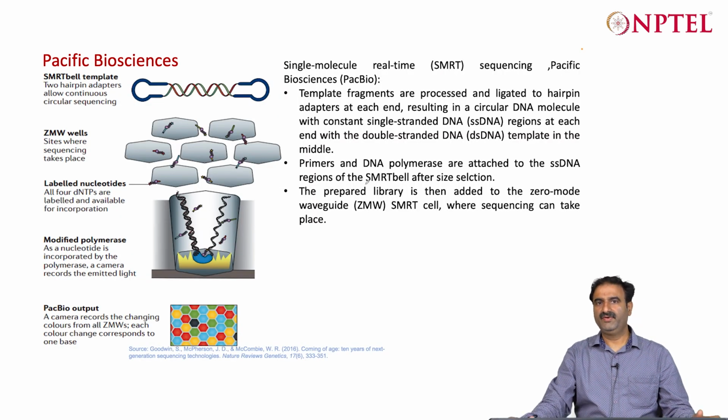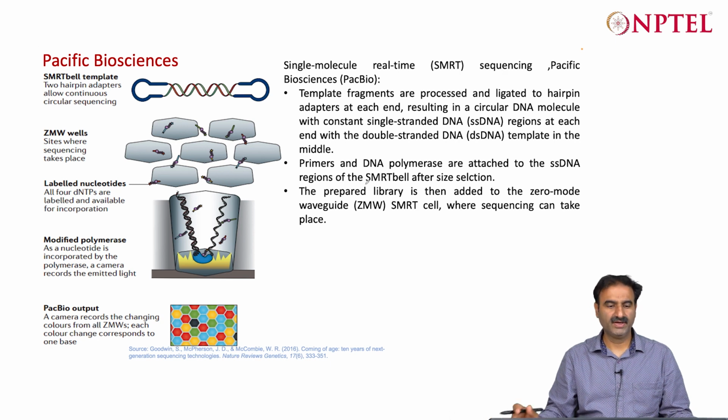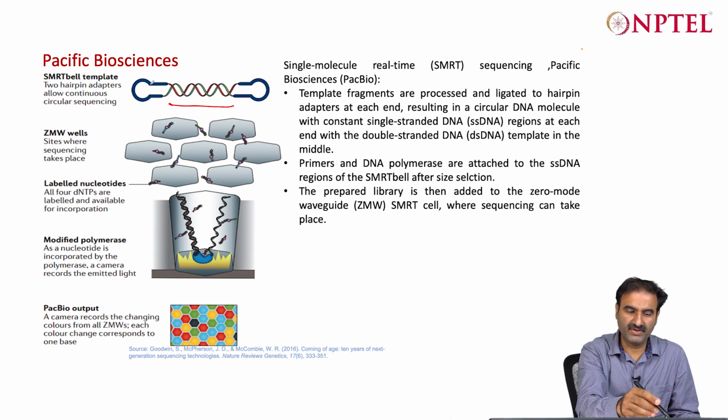We have seen Nanopore, but now we should see another long read sequencing technology, which is also very popular, although it is a bit expensive, and not all research groups and labs can afford the instrument or the sequencing. But it is improving and is used for larger genome sequencing. Here they have used a very beautiful approach: this is a piece of DNA with two strands, and they have attached bell-like templates, or hairpins, on both sides.